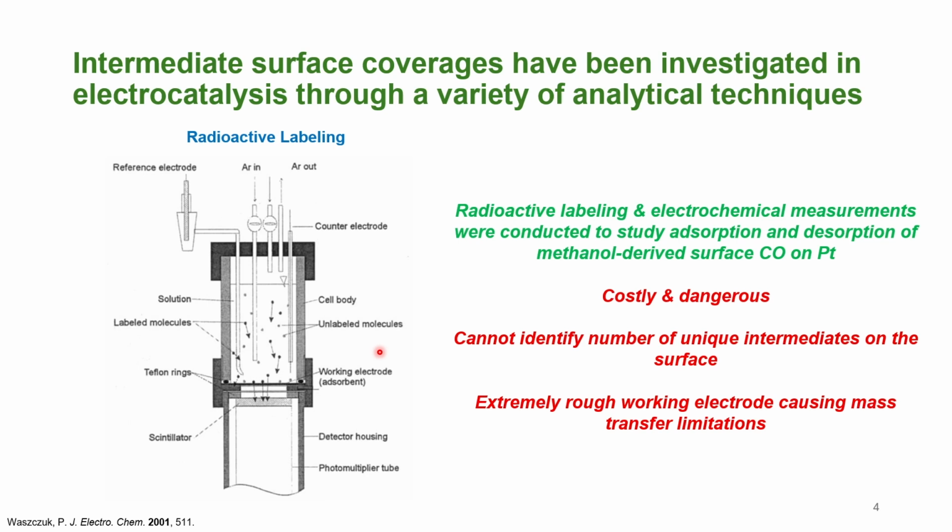So you can really only see the intermediates that are carbon labeled 14, essentially. And then also, these beta emissions, these soft beta rays, both emit in the bulk and at the surface of the electrode. And so therefore, the electrode has to be thick enough in order for the bulk signal to not overwhelm the detector, essentially.